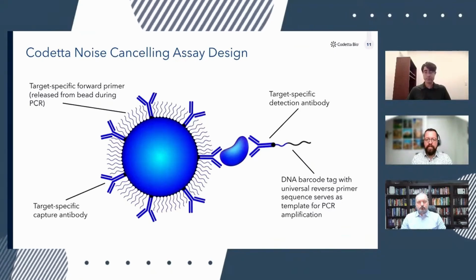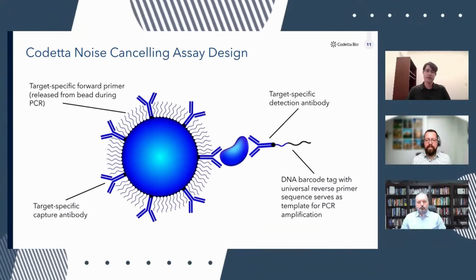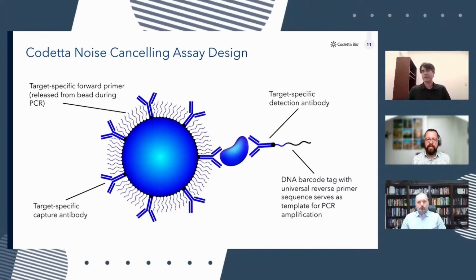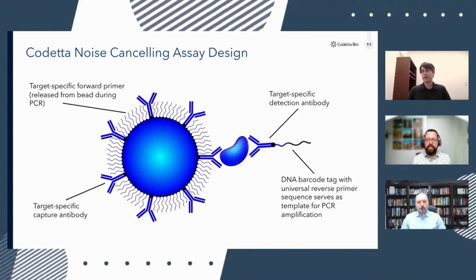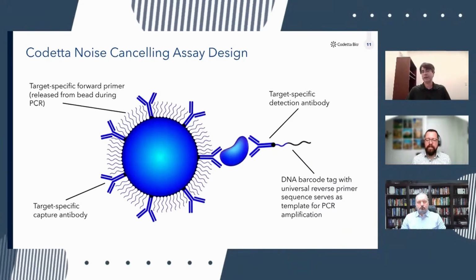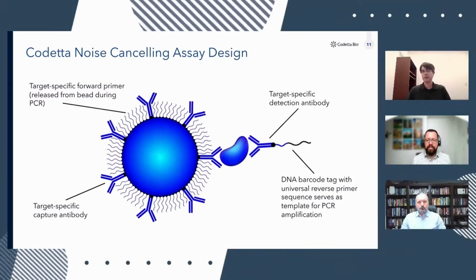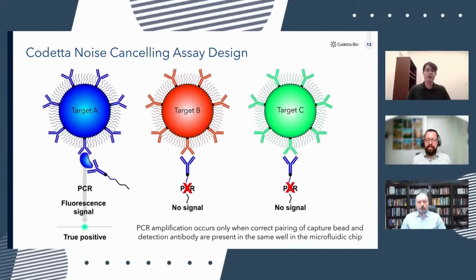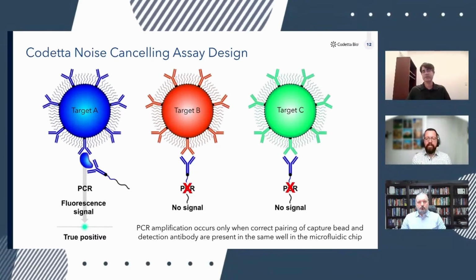So when the immunocomplex is formed and the detection antibody is bound to the bead through the target molecule, there's a DNA barcode tag that's unique and specific to each target of interest. And that unique DNA barcode tag contains a universal reverse primer, but a target-specific forward primer. And that target-specific forward primer sequence is complementary to the forward primers that are attached to the assay beads. So PCR amplification occurs only when there's the correct pairing of capture bead and detection antibody. And the next slide illustrates how this noise canceling approach enables reduction of nonspecific signal.